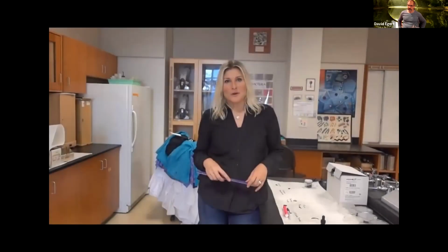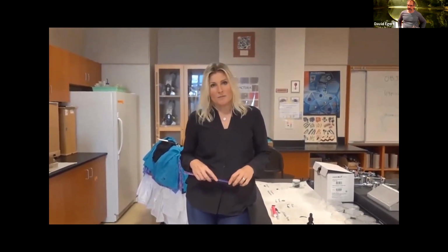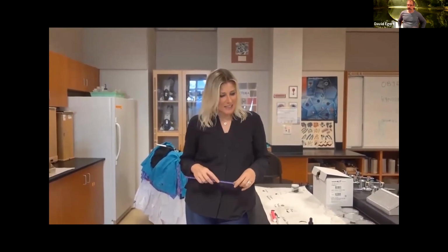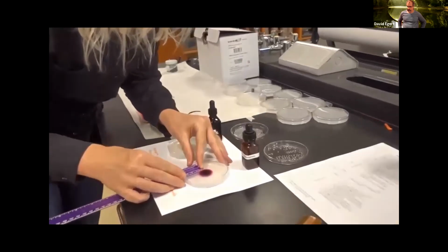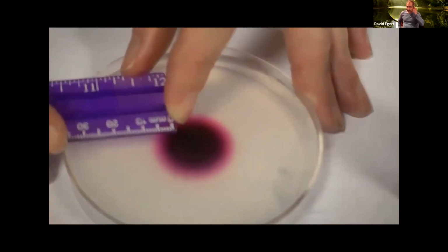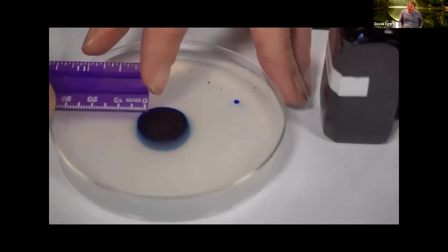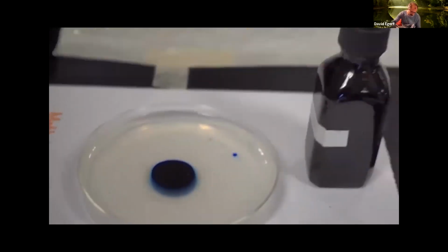All right, so we're here at our diffusion experiment, and we're going to do our time after 1 hour time point measurements. And so I'm just going to use the ruler again and measure from the edge of the well. And in this case, it looks like 7 millimeters for the potassium permanganate and 4 millimeters for the methylene blue.